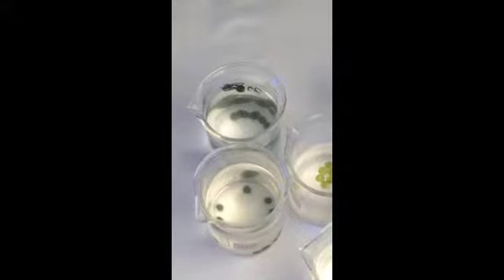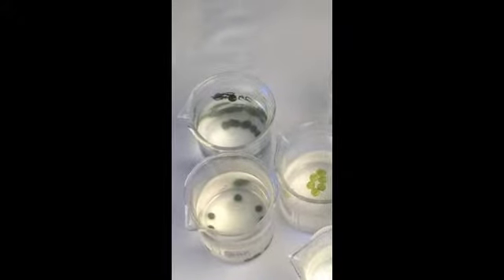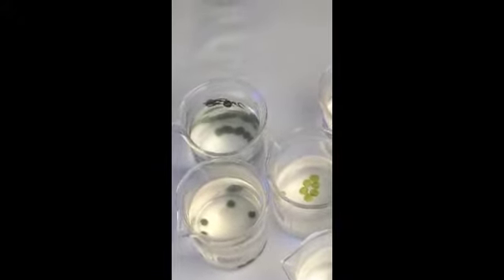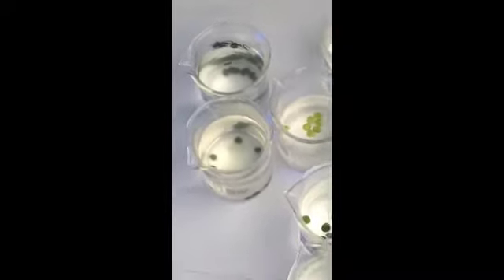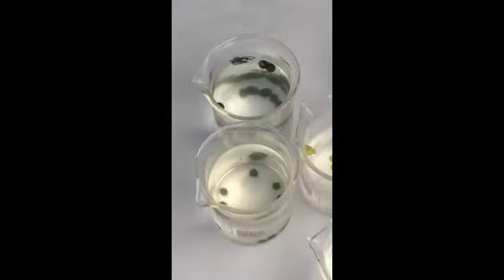Because the hot water denatured the plants, the ones inside the hot beaker did not float. On the other hand, the plants inside the room temperature beaker floated. The one with the room temperature is floating faster.